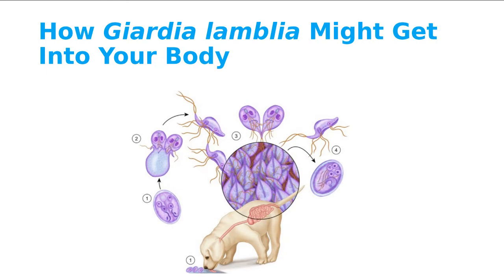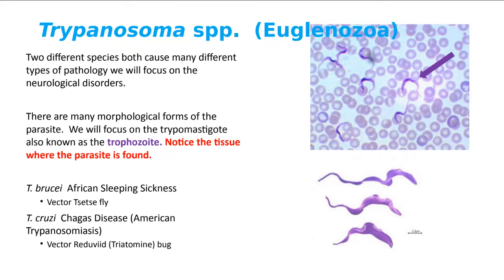Now we're going to the Euglenozoa. The two organisms I selected are hemoflagellates — they're going to be in blood. Can you see the blood in the image? There are two different species. Trypanosoma brucei gambiense causes African sleeping sickness — the vector is the tsetse fly. And Trypanosoma cruzi causes Chagas disease — the vector is the kissing bug, the reduviid bug, or the triatomine bug. You're only going to be responsible for the trophozoite.